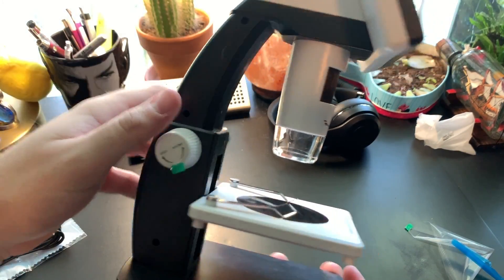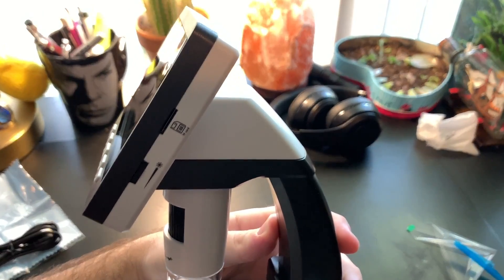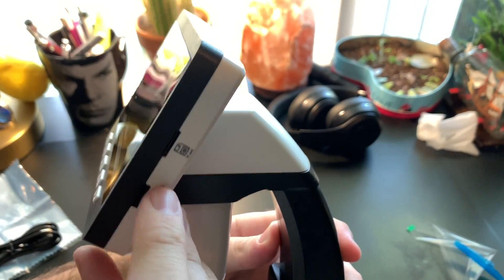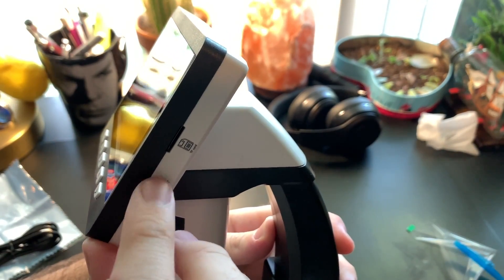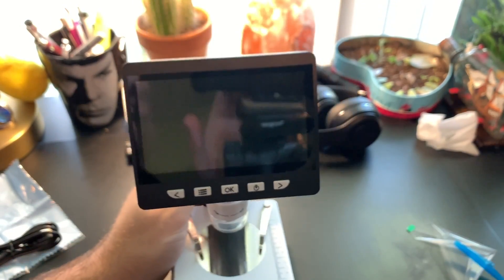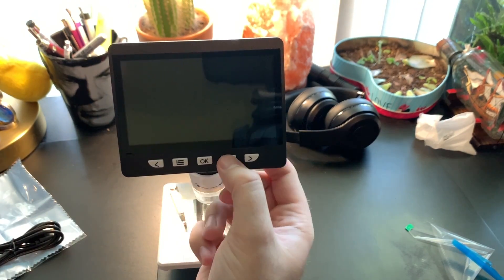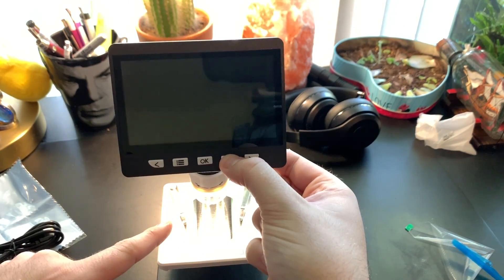Looking at the side, you can see where your micro SD card goes in on the top, and there's your brightness adjustment for the eight LEDs right there. There's not much else to show on the outside, so the only thing left to do is turn it on — just hold down the power button and the lights come on.